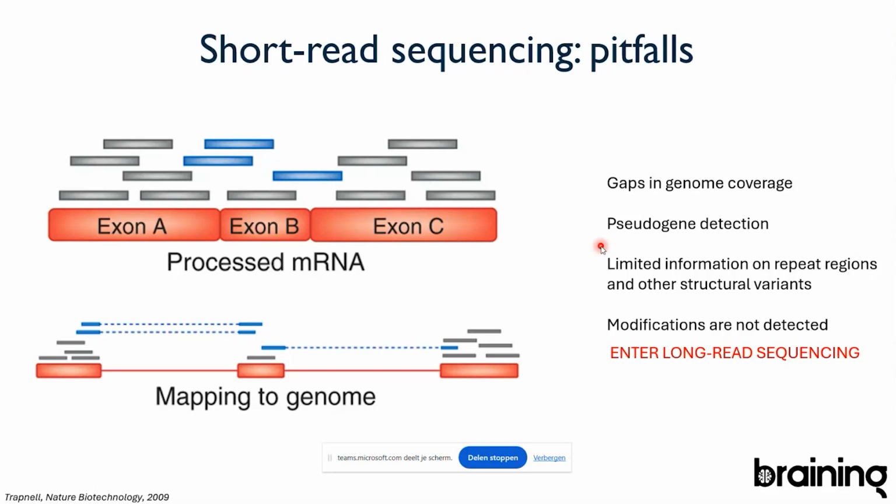So just as a technical note, if we want to sequence RNA, what we are sequencing very often is not the RNA directly. We do a reverse transcription reaction where we use an RNA molecule to produce copy DNA, and it's this copy DNA that we are going to sequence afterwards. Most of those sequencing methods are developed for DNA, so if we want to sequence RNA, we have to convert the RNA first into copy DNA, and it's this copy DNA that we're going to sequence, right?